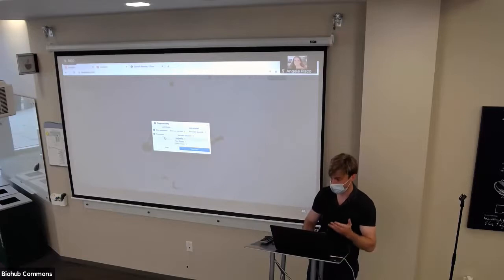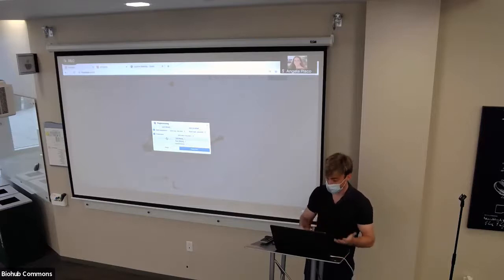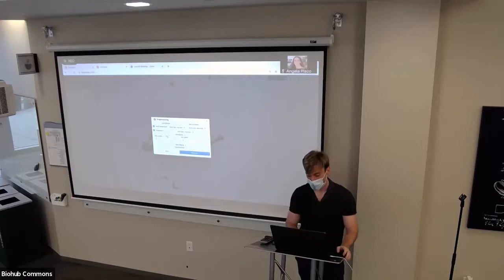And now it unlocks these options. These are collapsible windows just to make everything a little bit compact. And so it's not filtered in any way. It is, but let's say it's not. So we'll open up cell filtering. And then there are 2 options here. Eventually, all these options will have tooltips because right now they're just using ScanPy's nomenclature for what the parameter names are actually called, but they'll have tooltips.